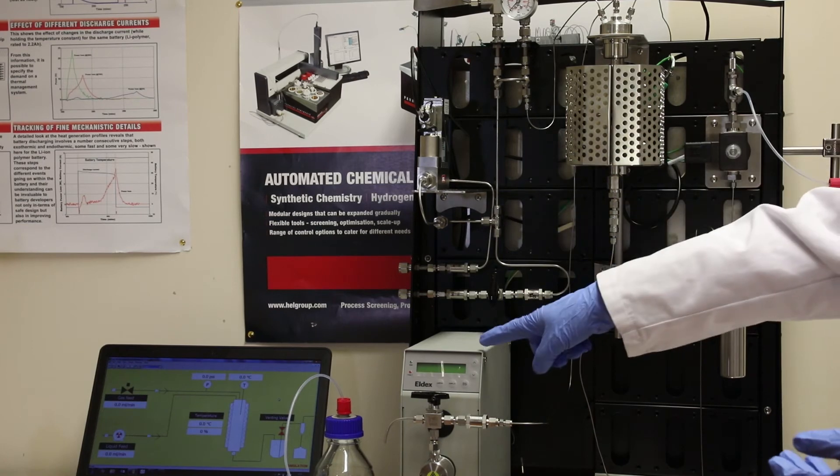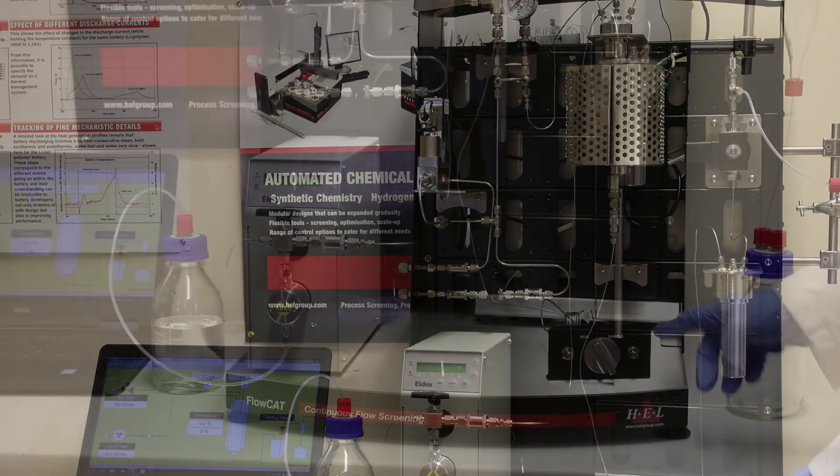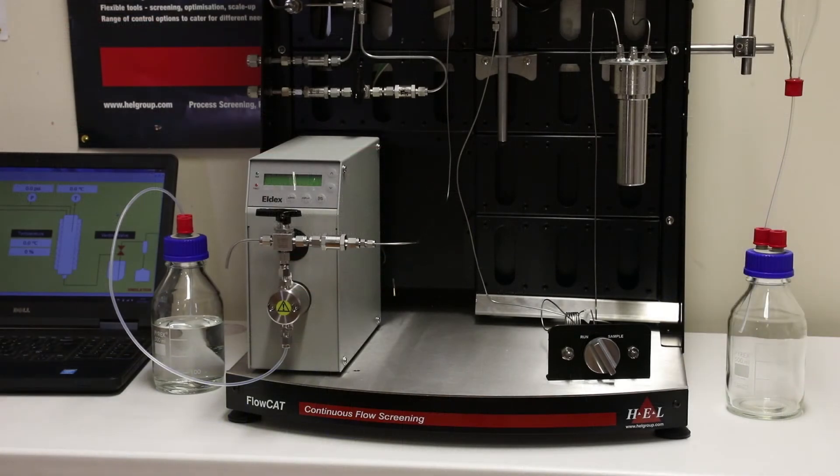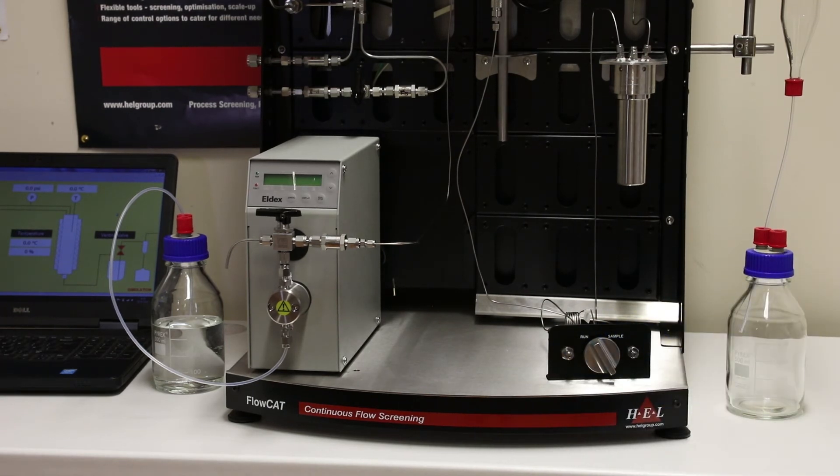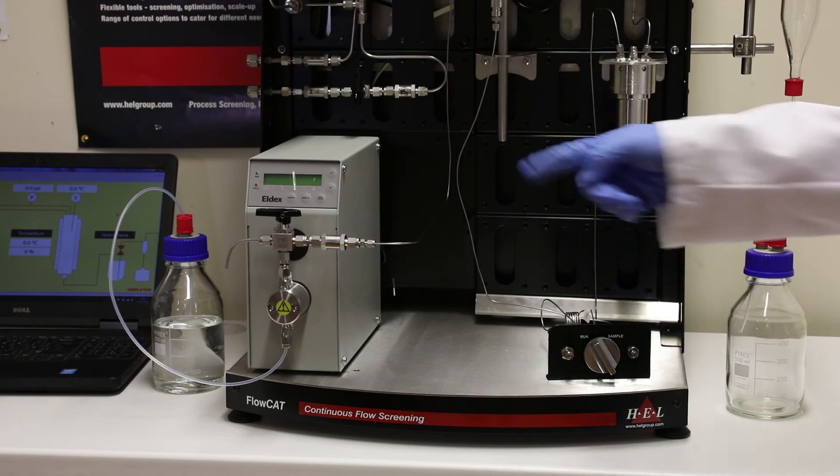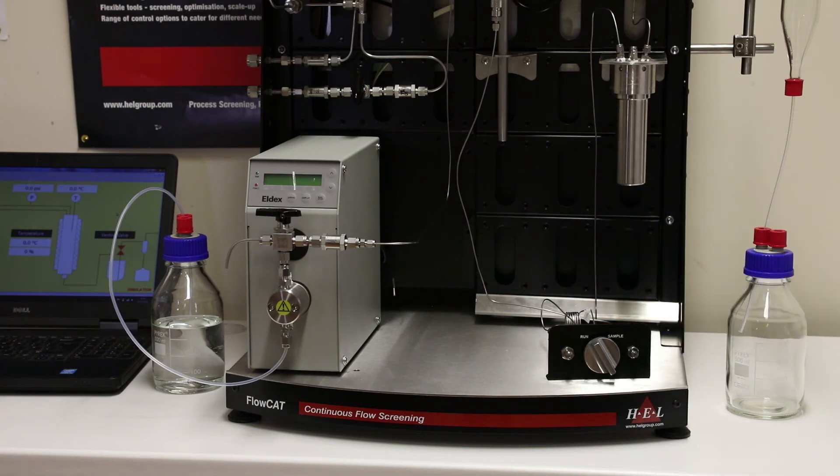So once your liquid has flown from your sources through the reactor, then comes out and we have a sampling valve here. It allows you to directly sample the reaction mix as it leaves the reactor. You can either turn this valve to get a small aliquot of liquid out, which you can then take for TLC, or whatever analytical technique you're using to monitor your reaction. In addition, you could replace this module by a PAT analysis, maybe something like a UV or an IR spectrometer, which we can link to our software to have all that data tied up together. A number of clients replace this with an automated valve, which is under the control of our software, and they'd link that through to a GC or a HPLC to give live monitoring of the reaction as you vary the conditions in the software.